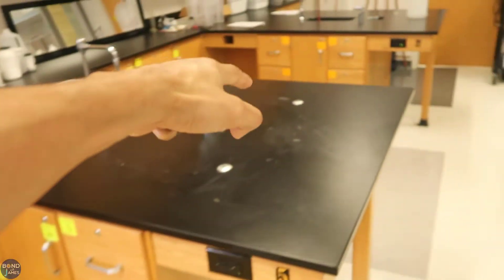Depending on the number that they got assigned, they had to get a certain amount of baking soda. For example, number one was supposed to obtain 0.50 grams of baking soda. I assigned numbers by going across the table: one, six, two, five, three, four — and then on the opposite side in reverse order.